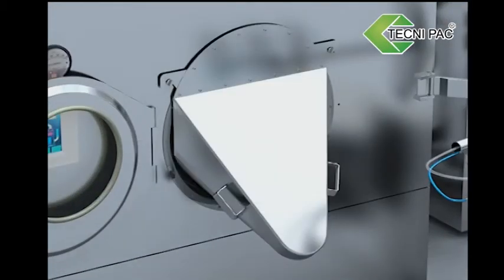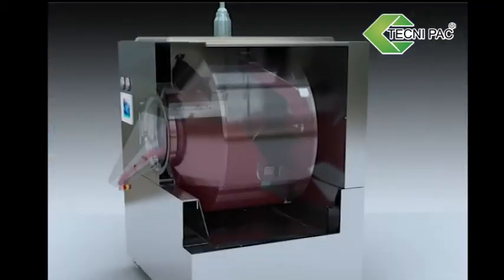Automatic Discharging Device. It consists of discharging tube and discharging hopper.